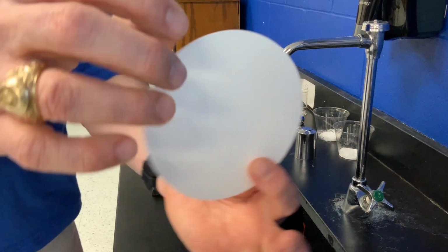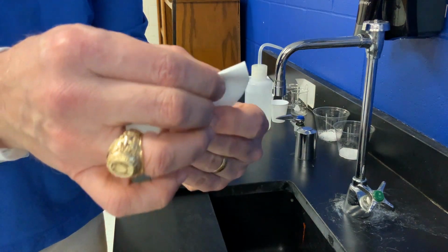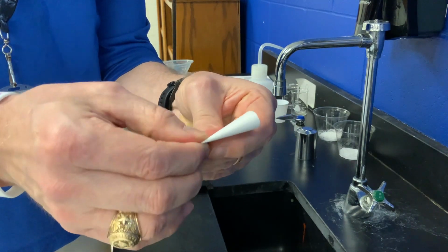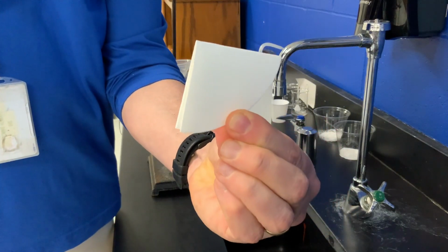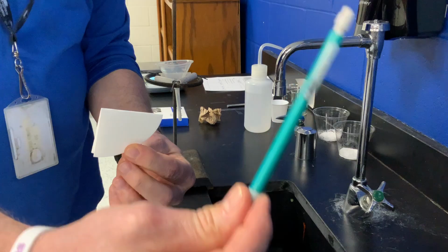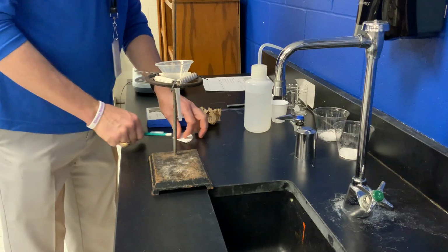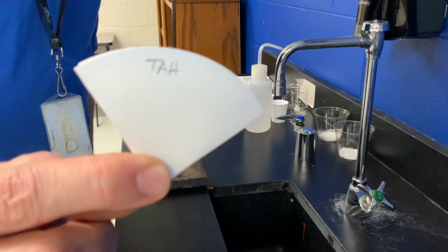In order to prepare the filtration apparatus, you take your filter paper, you fold it in half. It will look like that. Then you fold it in half again. And it will look like that, like a piece of pie. Then you take a pencil, not a pen, and you write your initials on it. That is so you can find it again on day 2. So my initials are TAH.